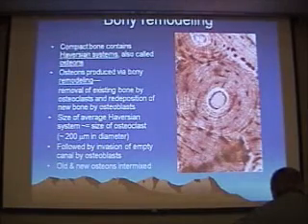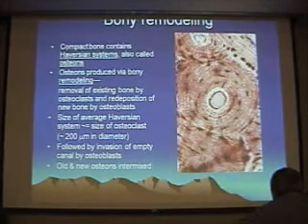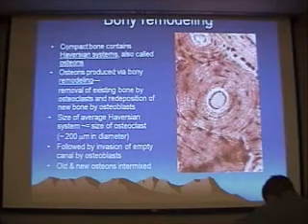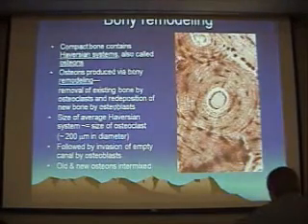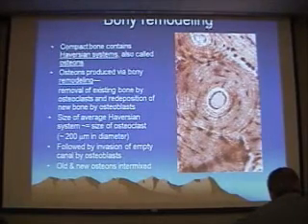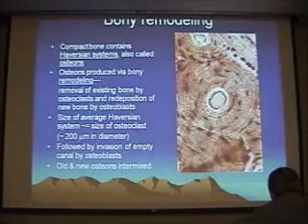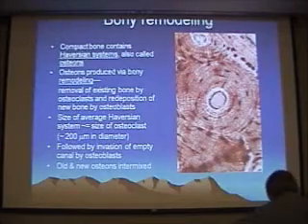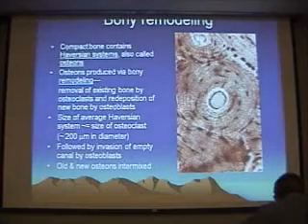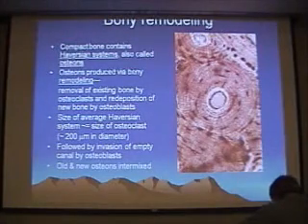These individual osteocytes have extensive cytoplasmic processes, which live within these little tiny spaces within the bone called canaliculi. And so when you look closely, you can see what look almost like little radiating lines or cracks. Those are the canaliculi that contain these cytoplasmic processes, which allow these osteocytes to communicate with each other.